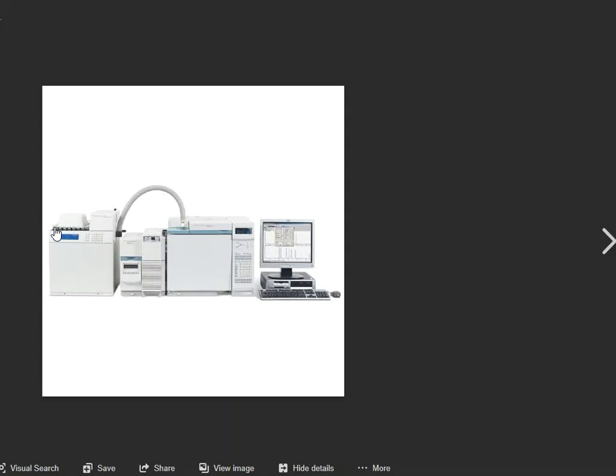All right, so what happens is that the vials are loaded up by you, and those vials are probably aqueous in nature. And this auto sampler will take the vial, and it will basically suck one of the vials up underneath the hood. So it transfers it up in the oven. And this is going to be where the sample gets heated. So up underneath this kind of tray, the sample vial will go into, and it kind of gets lowered down a little bit.